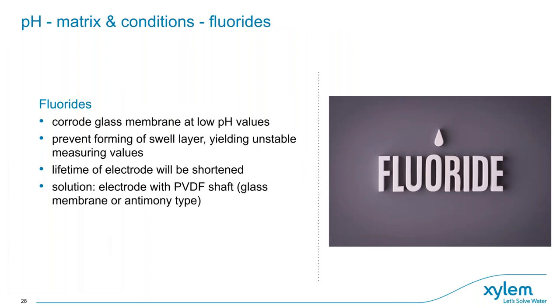Fluorides in the sample can corrode the glass membrane, but only if the pH value is low enough that they exist as hydrofluoric acid. This prevents forming of the swell layer and yields unstable measurements, and also shortens electrode lifetime. A solution is to use electrodes with a PVDF shaft — normally the glass membrane is still present but the shaft is protected. Another option is an antimony-type electrode, which is also pH sensitive, but has several disadvantages: it has a different zero point and it is a heavy metal, which is generally undesirable.